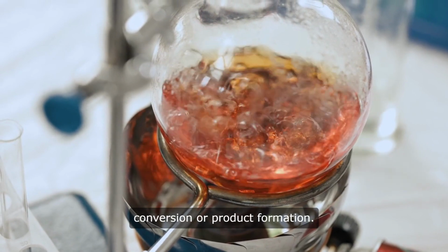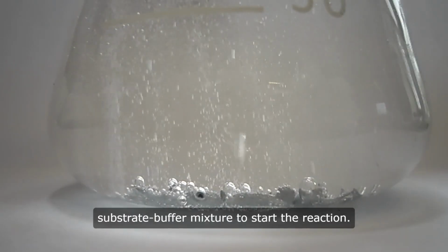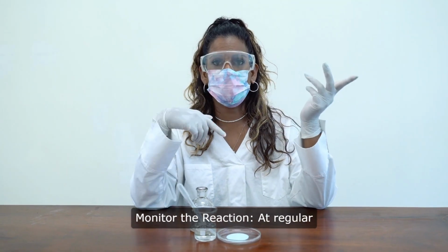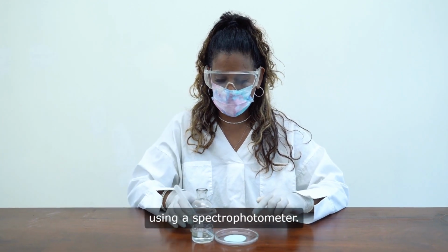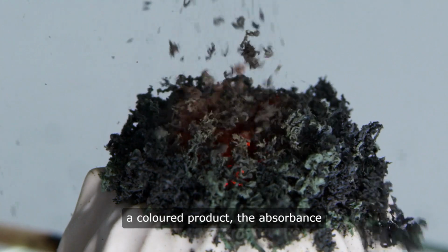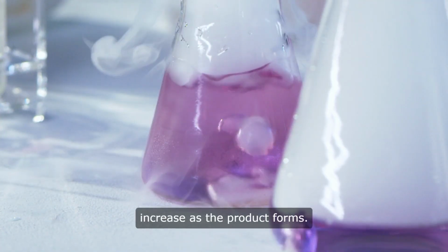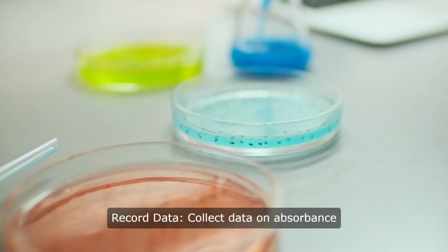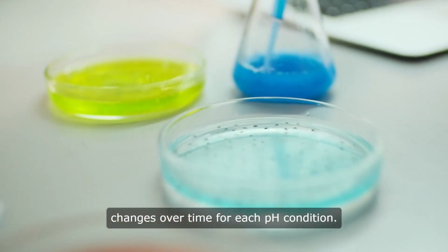Initiate the reaction. Add the enzyme to the substrate buffer mixture to start the reaction. Monitor the reaction. At regular intervals, measure the absorbance using a spectrophotometer. For example, if the reaction produces a colored product, the absorbance at a specific wavelength will increase as the product forms. Record data. Collect data on absorbance changes over time for each pH condition.